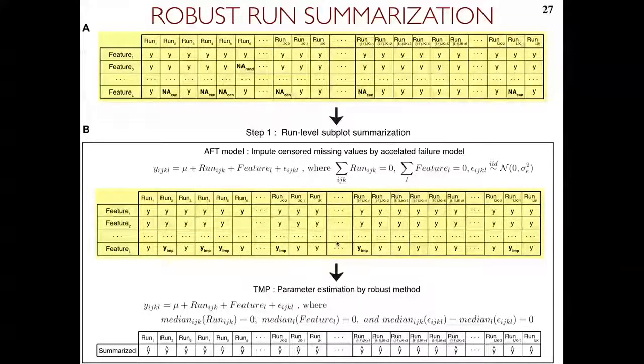But if you just need one value, does that mean you're potentially imputing almost an entire experiment's worth of data?